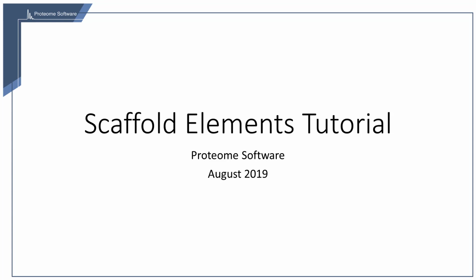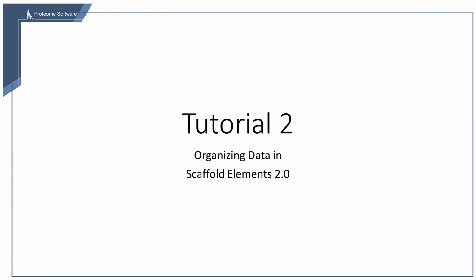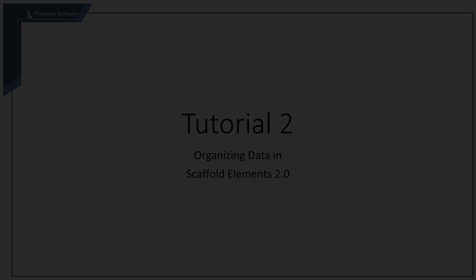This tutorial follows Scaffold Elements 2 Tutorial 1, loading data into Scaffold Elements 2. The following video will walk users through the process of organizing samples once they have been loaded. Please consult Tutorial 1 for information on loading data.